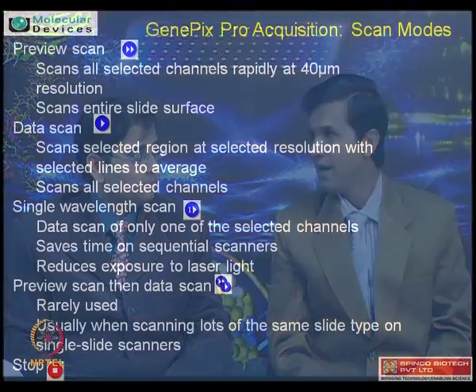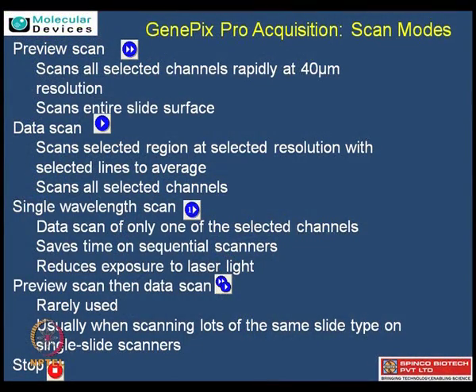True. So the basic GUI which we are going to see in a few minutes actually contains three different areas. The first one is image laser controls. So there you want to see which kind of laser I am going to use. And the second one is the different features which are used for controlling the image. And towards the right hand side we have a pane which is helpful for hardware controls.